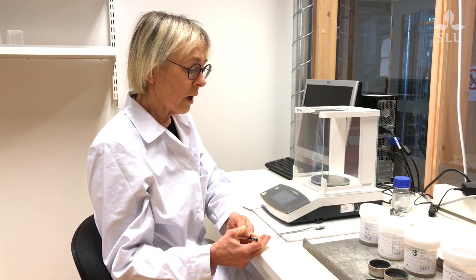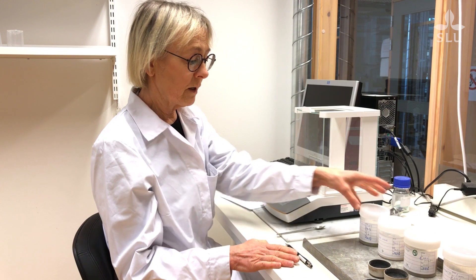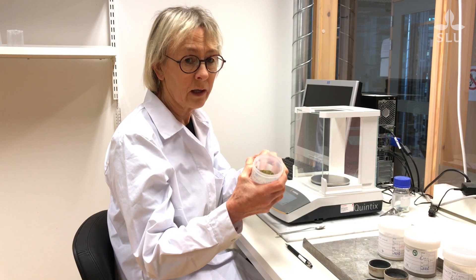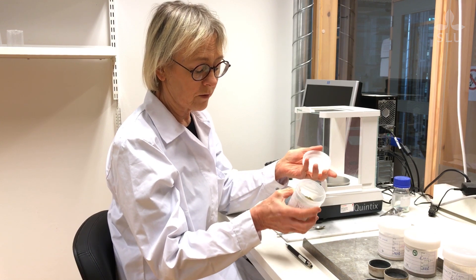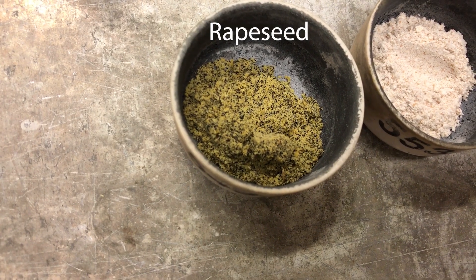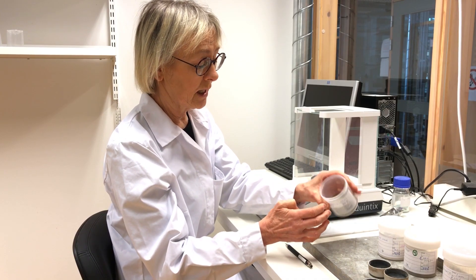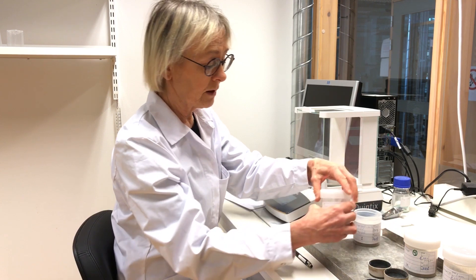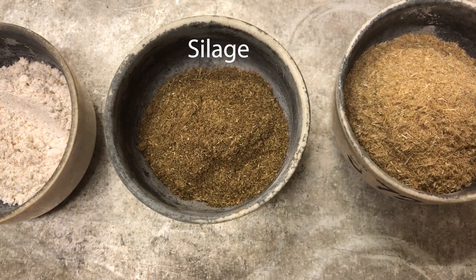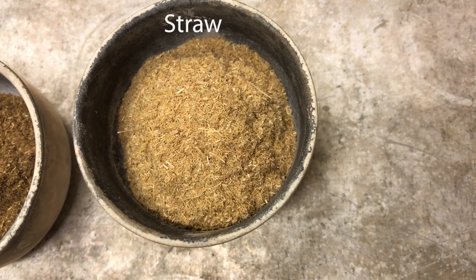So now I will show you how to do this final drying to determine the dry matter content you have in your sample when you analyze it. Here I have picked out some samples: rapeseed — pre-dried and milled — a wheat sample, a silage sample, and a straw sample.